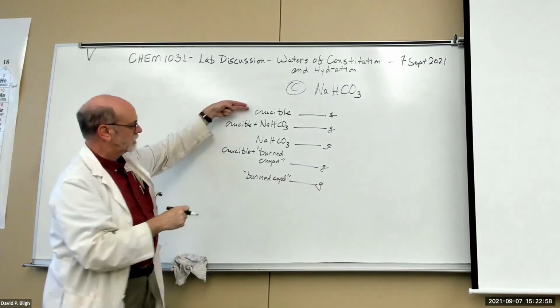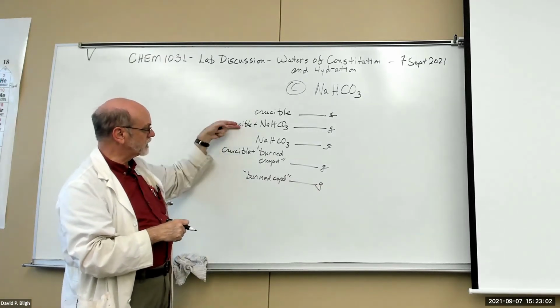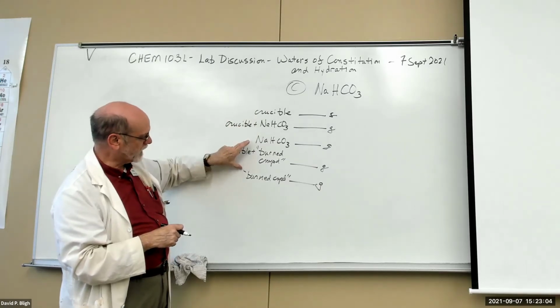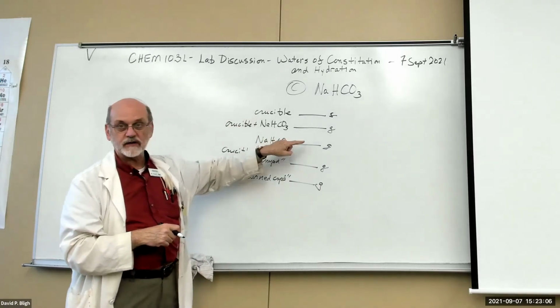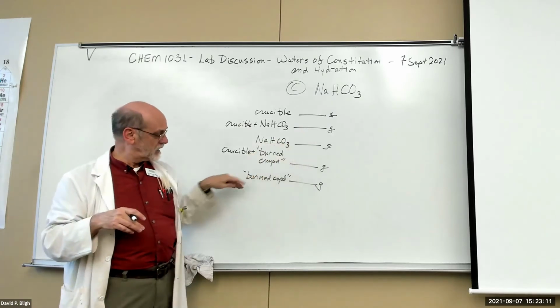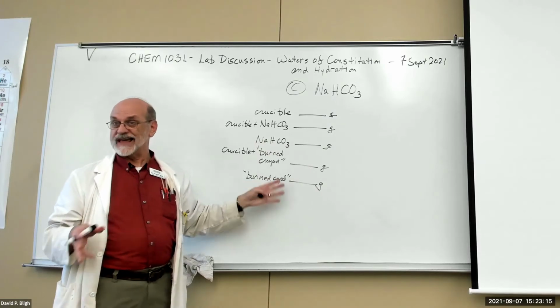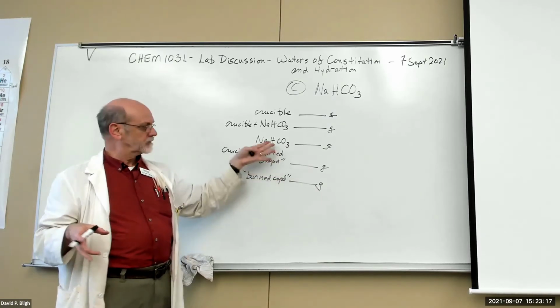After you subtract the crucible from this one, that gives you the burned compound. Crucible from this one gives you this one. So here's your comparison. It started out at 2.5 grams here, roughly. You're going to know exactly 4 decimal places. And here is what's left over. So it should be less, obviously.